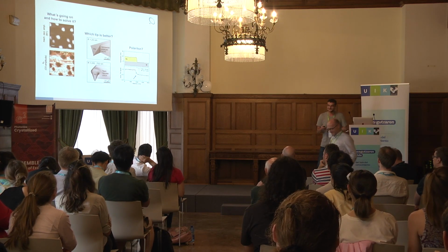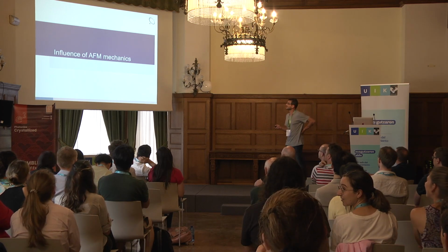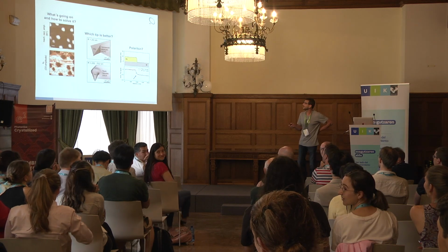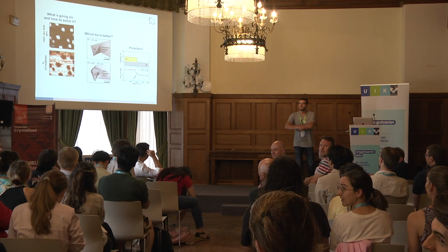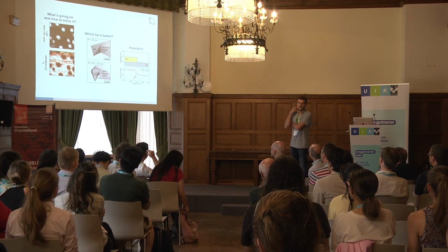So then let me explain a little bit. I want to start with this one. It's called the influence of AFM mechanics. Rainer, can you go back to the previous slide? I have one question about your two tips. Yeah, this one. The fact that your upper tip is not radially symmetric, isn't that a problem?